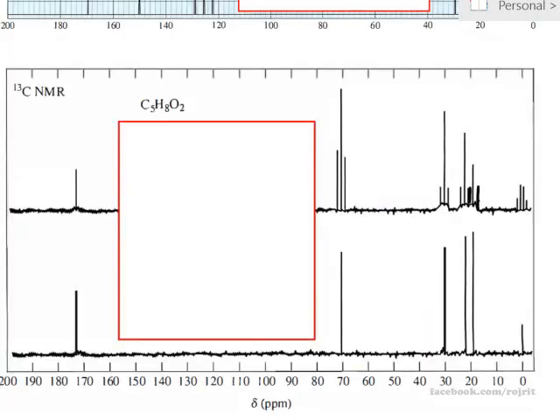Okay, now it's C5H8O2. Okay, you may pause here. What you have to do is propose the structure of the molecule using only this carbon-13 NMR. After you finish, resume the video and we will see the answer.